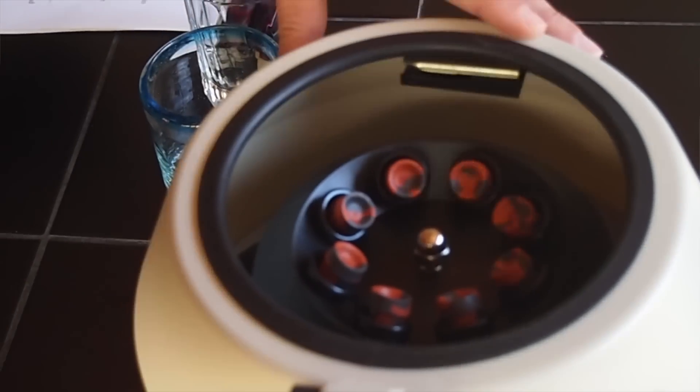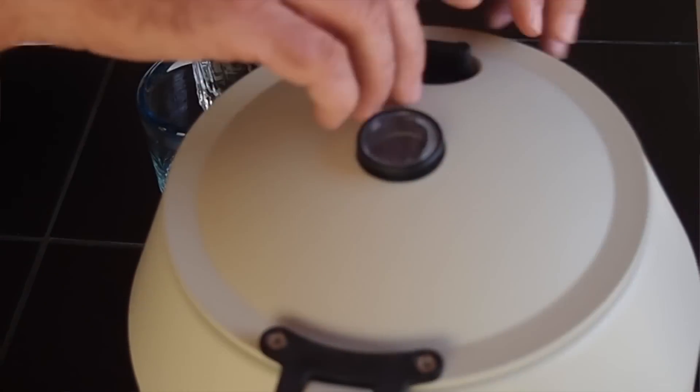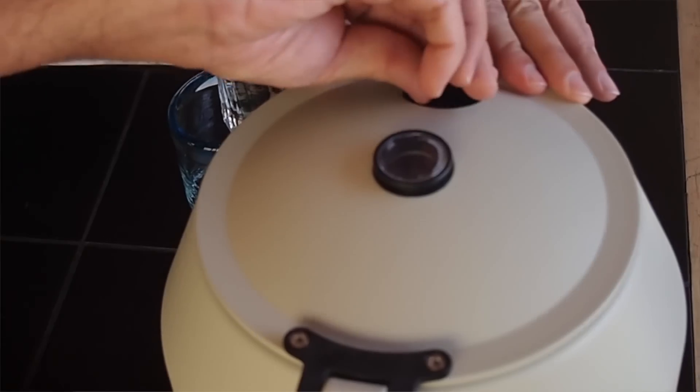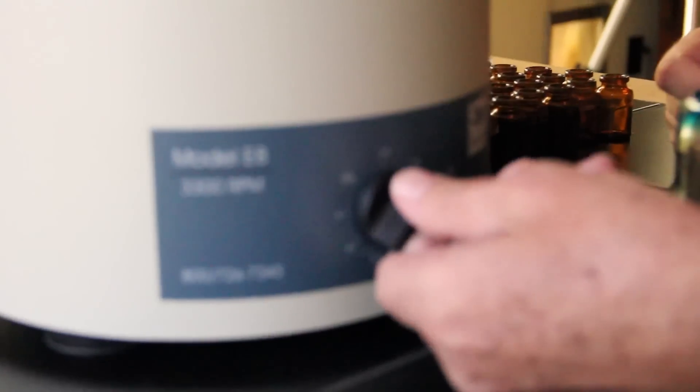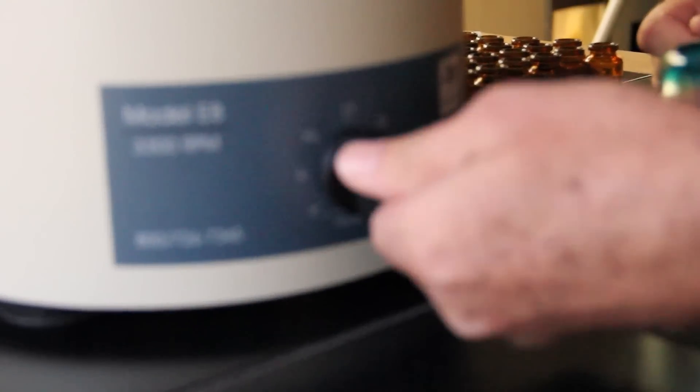Eight tubes, lock her down, set it on 30 minutes.